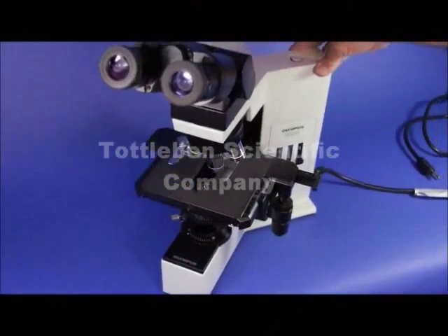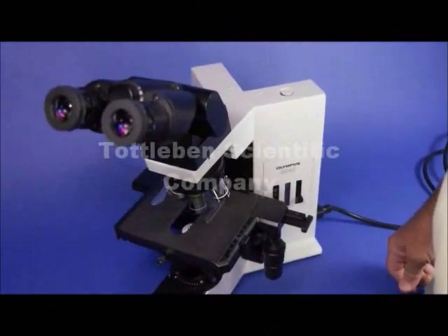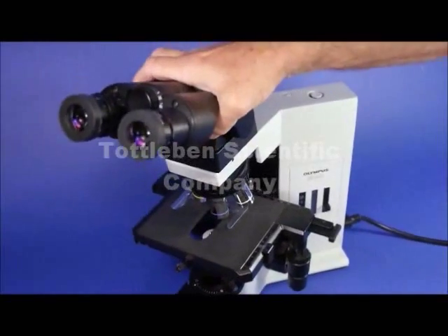What we have here is an Olympus BX40. It's been one of Olympus' most famous microscopes ever. And this one is equipped with some really nice things. I want to point them out to you.